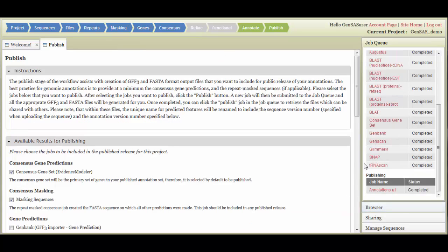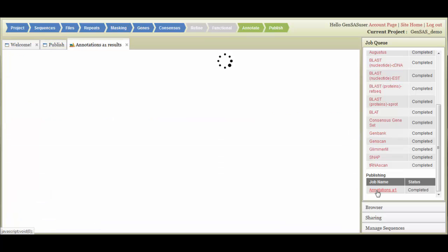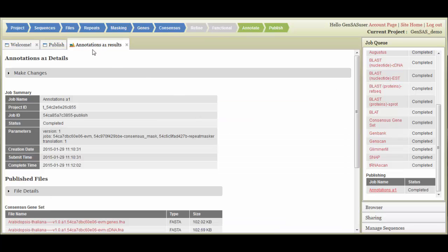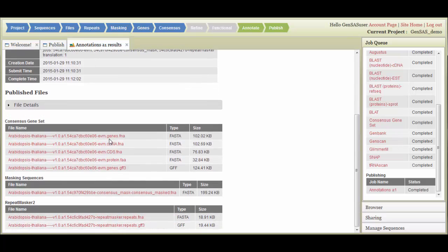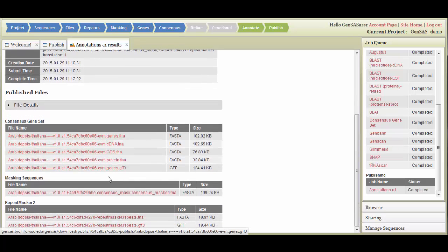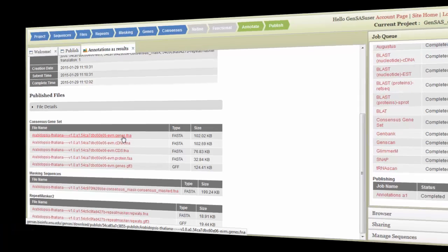Once the publishing job is completed, click on the job name in the job queue. This will open the results tab. On this tab, you will find the files that were generated. To download the files, just click on the file name.